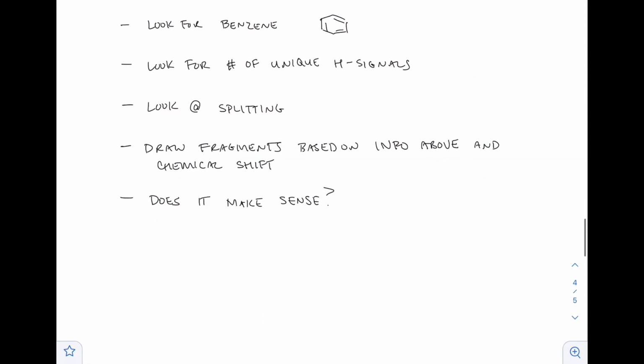Okay, let's go. Almost done, y'all. I thought that, working through the problems the way I do, it would be helpful to approach it like this. So I put it into words, written word at least. So look for the benzene, because if you have an unknown NMR structure and it's around 7, then you're stoked. Again, like I said, you've got a benzene ring with something on it, probably, because they're not just going to give you benzene. It's too easy.